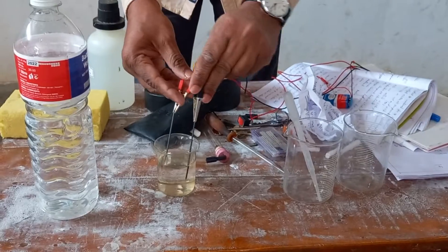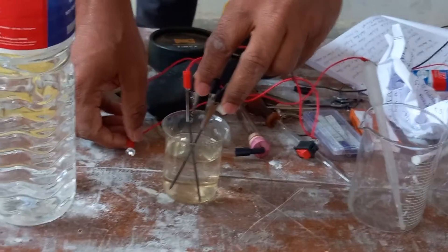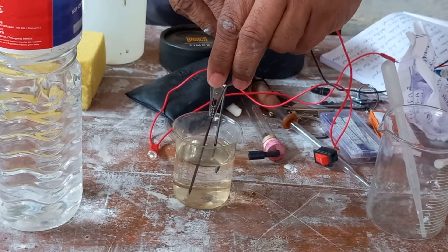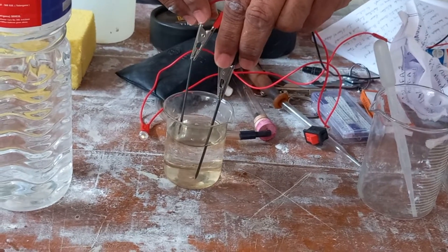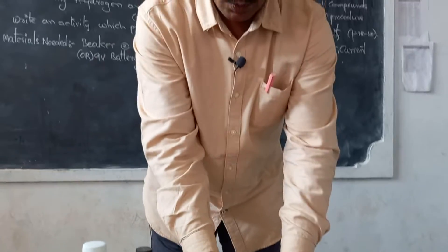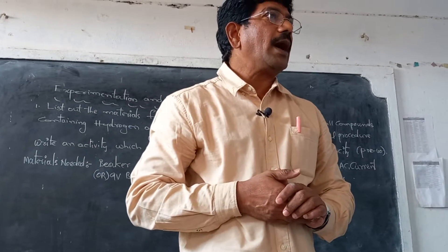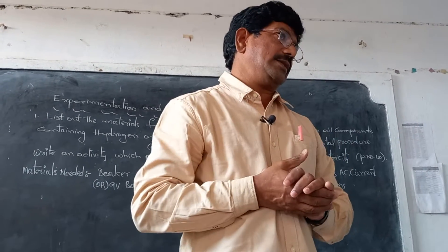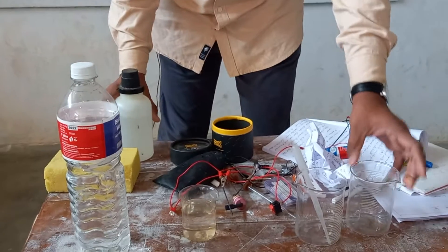Observe this — the bulb is not glowing. The bulb is not glowing. Why is the bulb not glowing when I have taken distilled water? Because there are no ions — there are no ions. Are you clear?